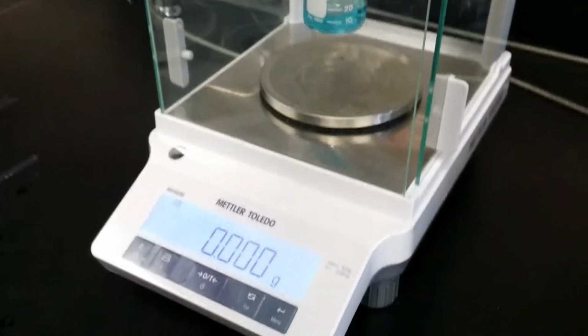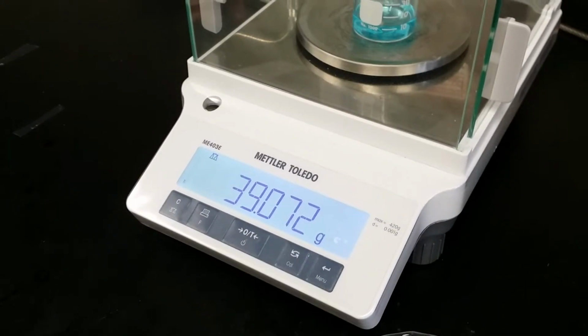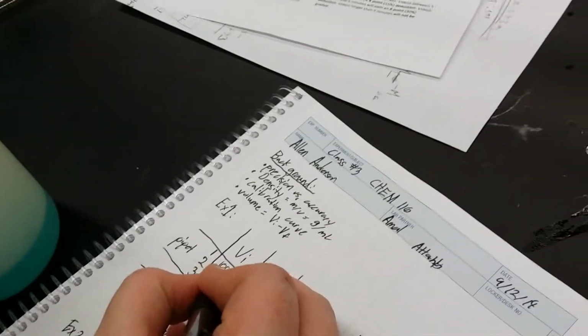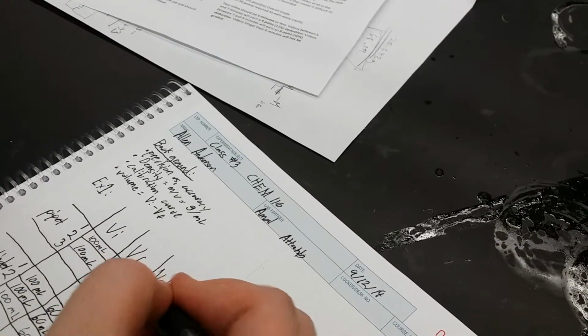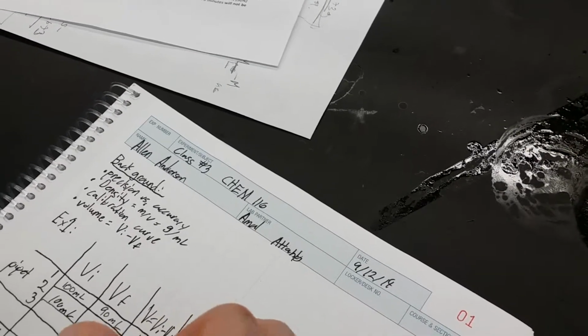The beaker with the liquid weighs 39.072 grams. And then our volume initially was 100 milliliters, and finally it was 90 milliliters. And so our total volume, which is volume initial minus volume final, is 10 milliliters.